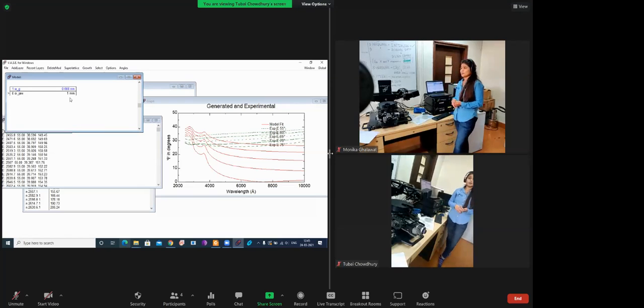I'm not working in this field, but this is a logical question. If I am going for the Cauchy model in every metal layer, then there is no point of making any. Okay, maybe you are right, but then I have a simple question: why should I go for any kind of model which is already known for metal? Yes, oxide layers will be there.